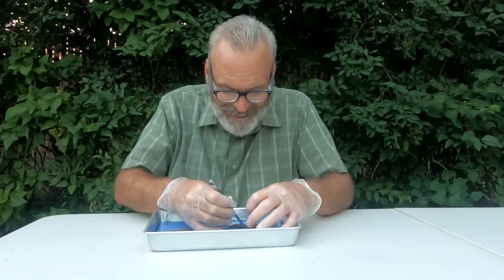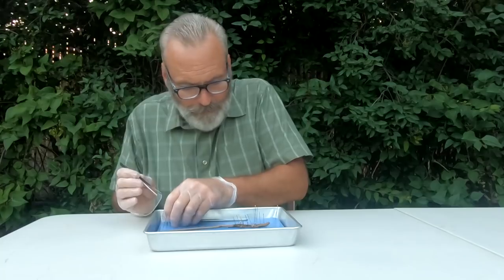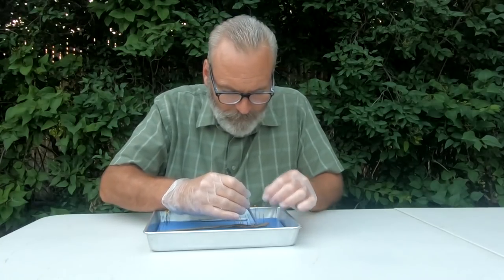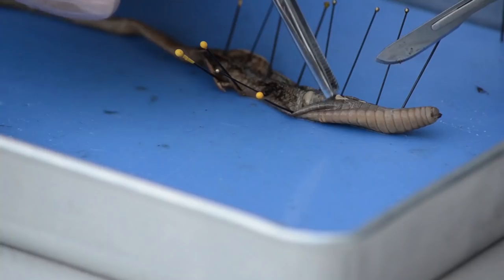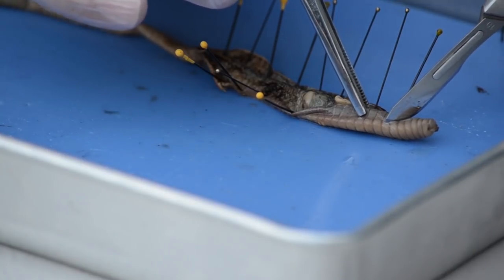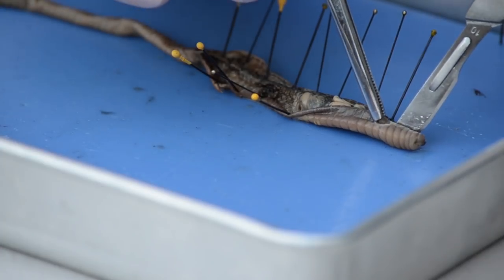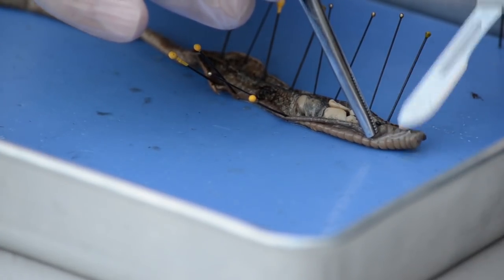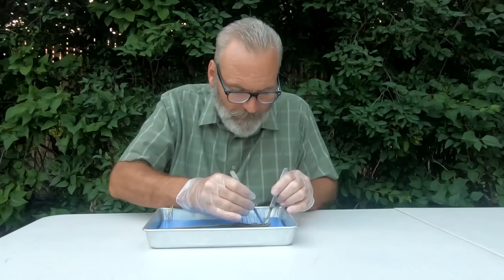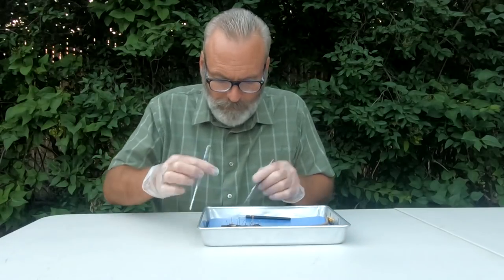We're using insect pins here — different insect pins to help us with holding this out. We need to cut that just a little more. We almost have this open the whole way, so we'll be able to see it a little better. We'll spin that back around for you.